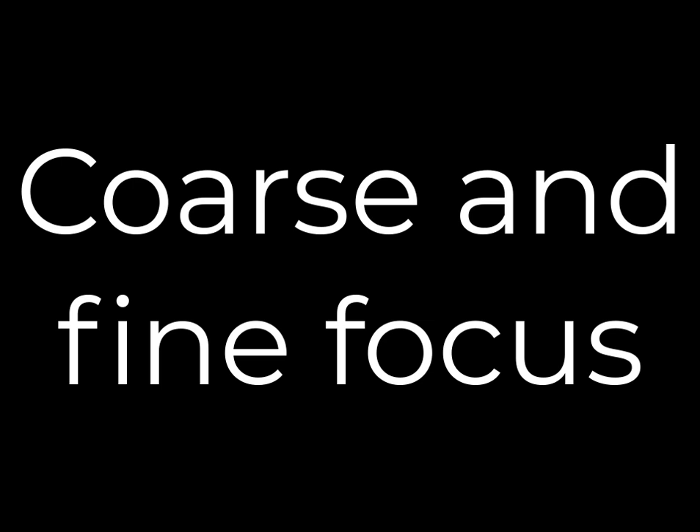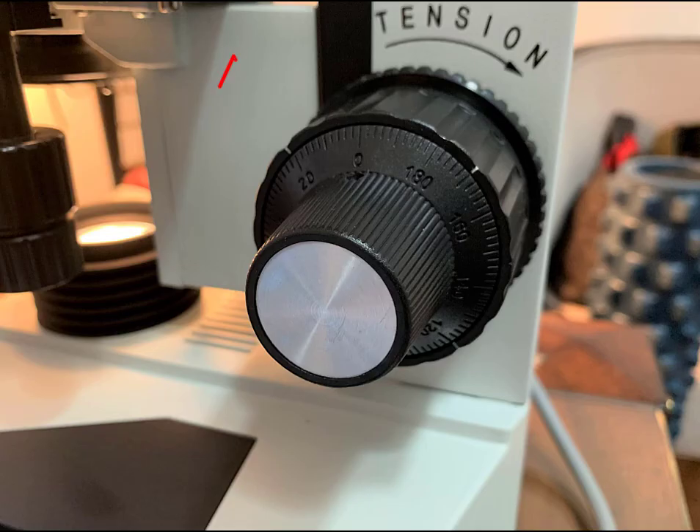Let's review the coarse and fine focus. These are the knobs on the side of the microscope that control the distance of the stage from the objective lens, and this is what is going to allow you to bring the image on the slide into focus so that you can see it clearly. The coarse focus is the larger of the two knobs located on the inside — it will move the stage very quickly in large movements. The fine focus makes very small adjustments so that when you have the slide nearly in focus, you can just make some fine adjustments.